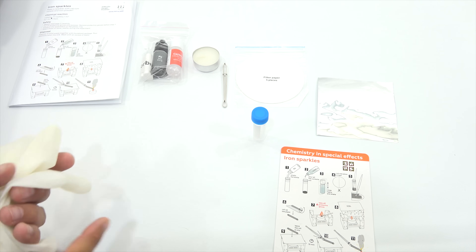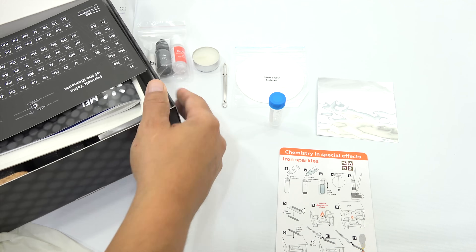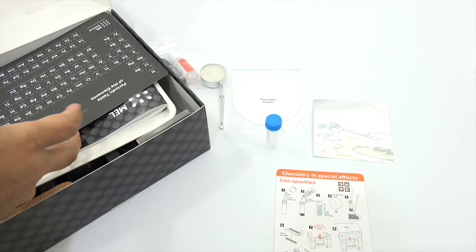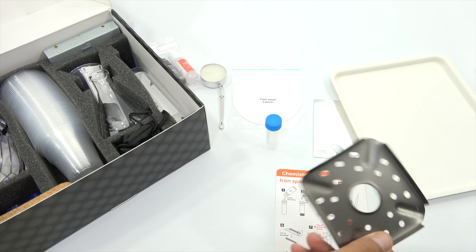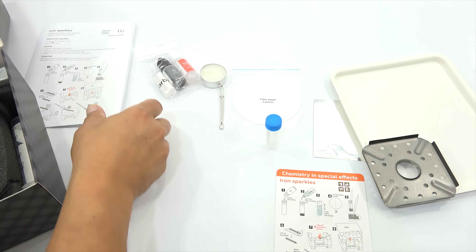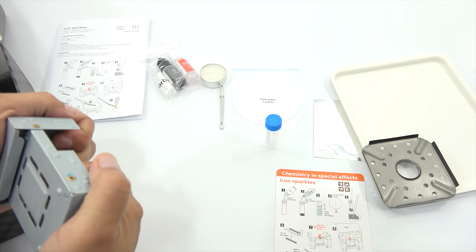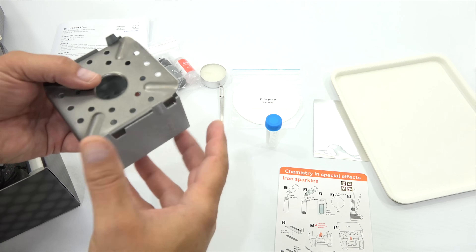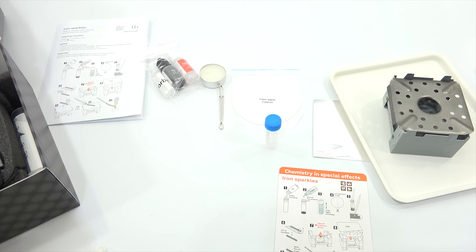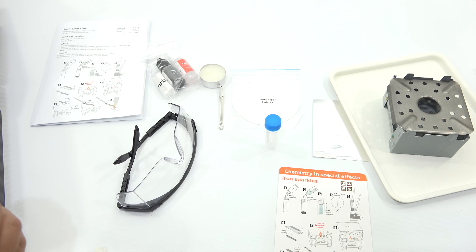The gloves I had off to the side from another experiment, and I did need one little vial. Here is the bigger starter kit. You'll need the tray, and then the little top piece for the burner, and then the actual little stove. And very important — your safety goggles. I think that's all I need. When I come back we'll do this experiment.